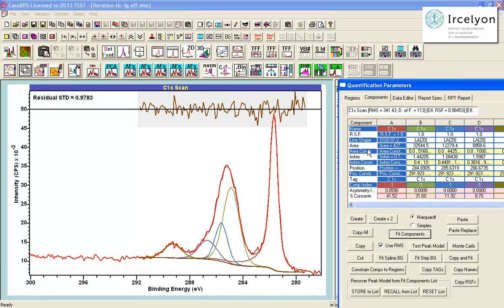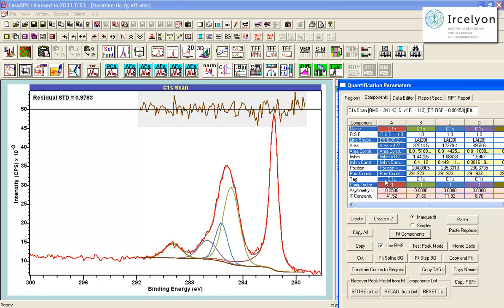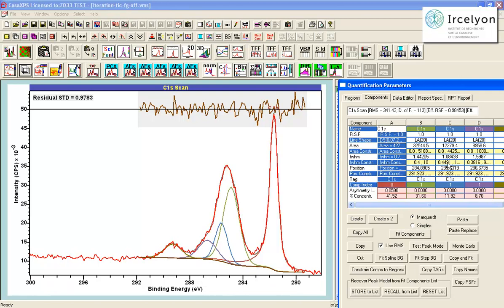And the question is, is this an example of a peak model where I can identify the carbide signal and pretty much ignore all the rest? So if I think this is my carbide carbon 1s, then the only role played by these other component peaks is to support the fitting of the data with this carbide peak.